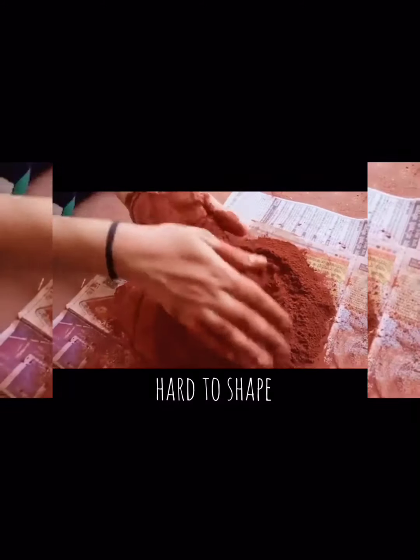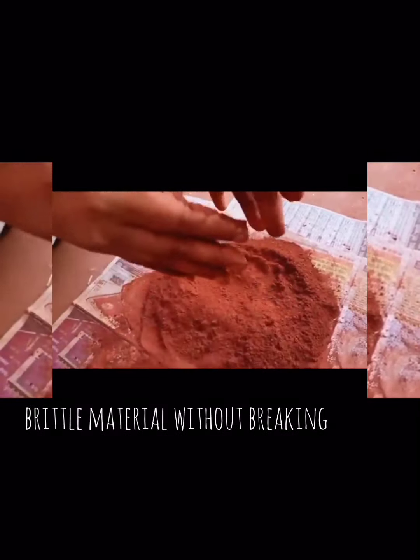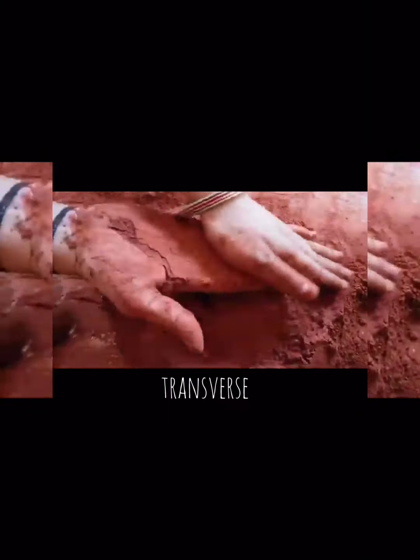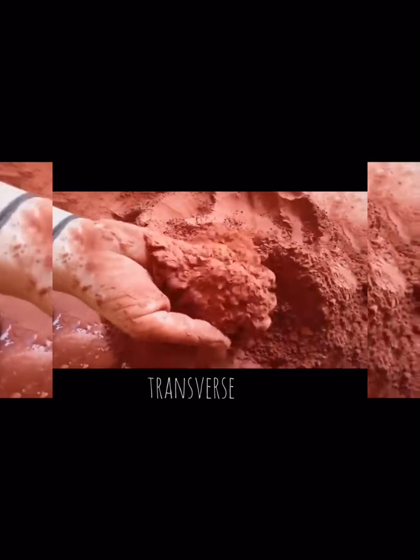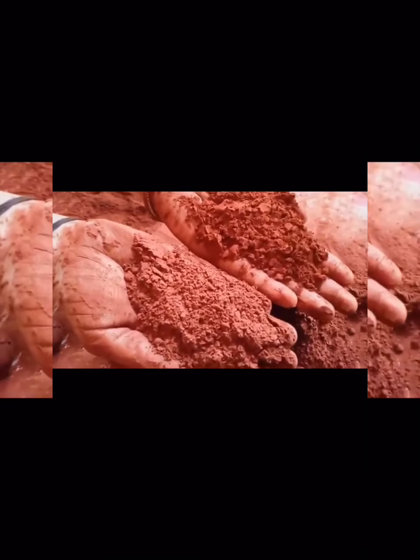Ceramics are hard to shape into the proper test structure. To grab the brittle material without breaking is difficult. An alignment of the test samples to avoid bending stresses, which can destroy the sample, is difficult to perform. So, a transverse bending test is used and a modulus of rupture, or MOR, is determined.